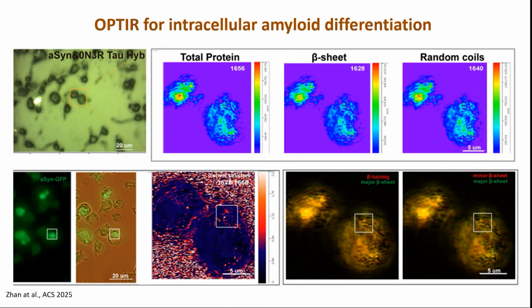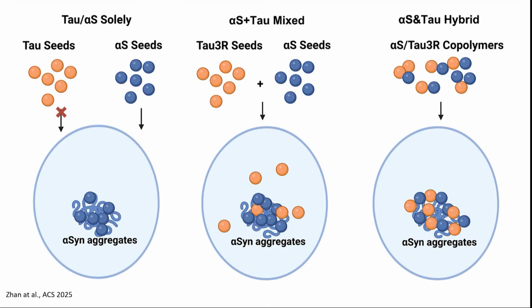Also, we looked at the cells, and in those cells we looked at different amyloids, specifically tau and alpha-synuclein. We described many of those amyloids that can be simultaneously present in the tissue, and discussed their structure, which was detected directly in tissue.